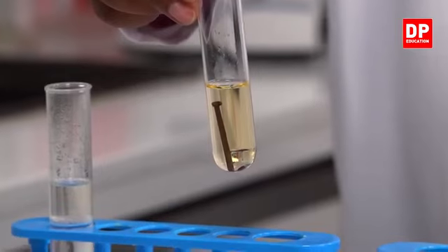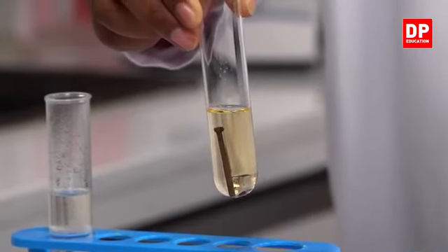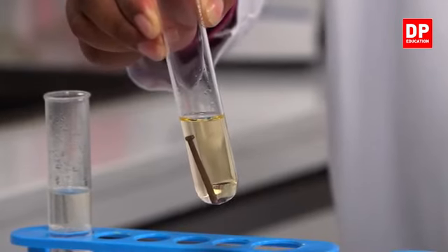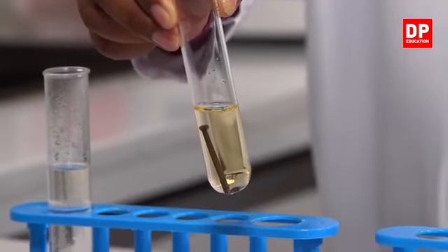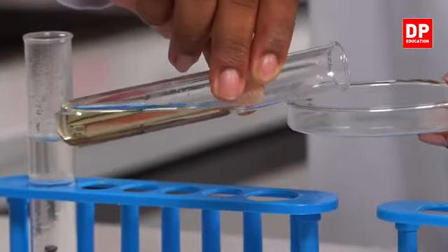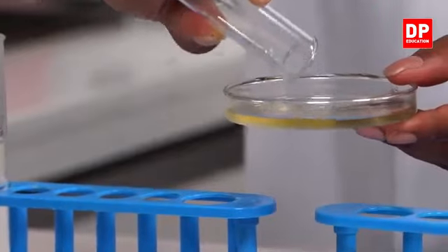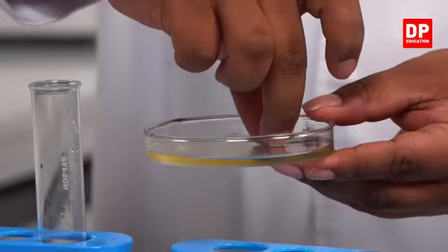Initially it didn't have any color. It was colorless. Now it shows some amount of yellow color, light yellow color. So let's see what has happened to the iron nail. So I'll put this solution into the Petri dish, and now I'm going to take the iron nail out.